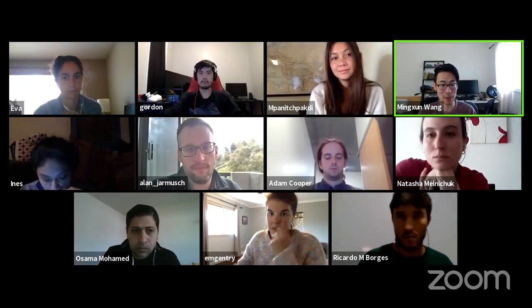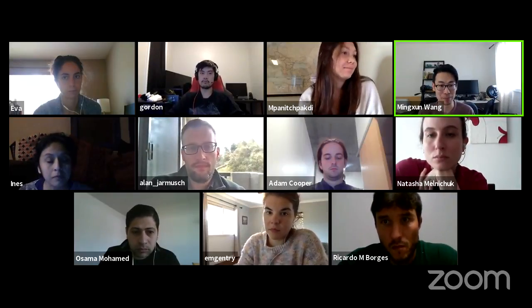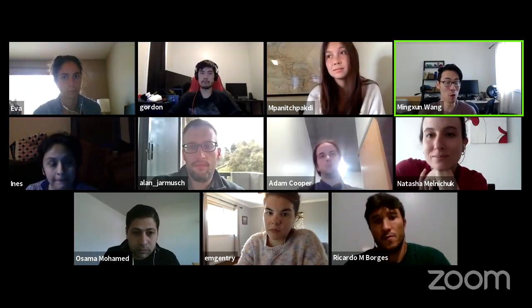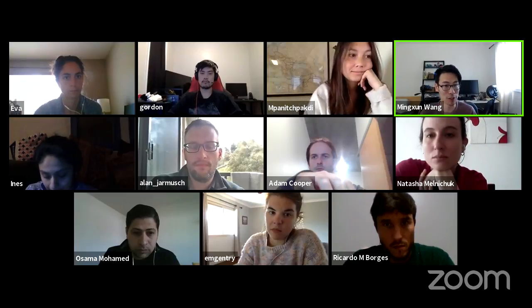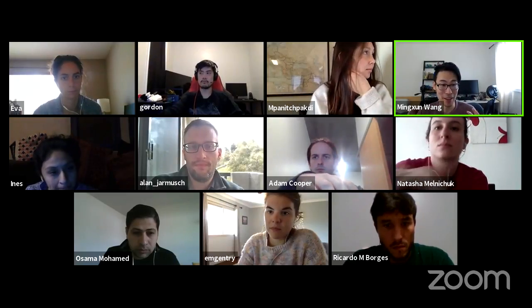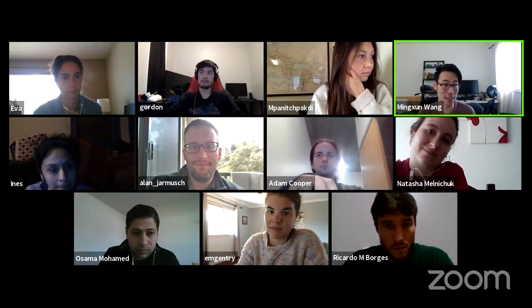There's a lot of possibility for us to share with you tools that we've developed. But we would love for your feedback. What problems stump you? What do you think is important given your familiarity with our tools? As well, you are not just simply passive bystanders absorbing knowledge. We would love for you all to host sessions as well.